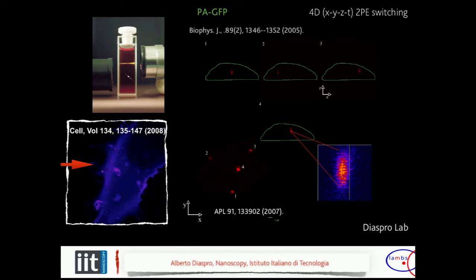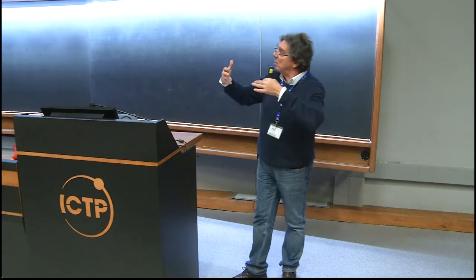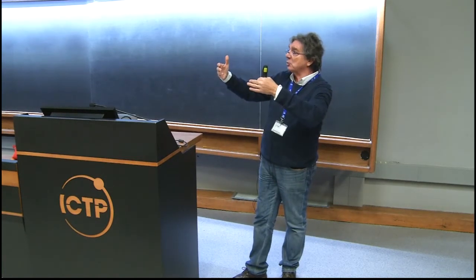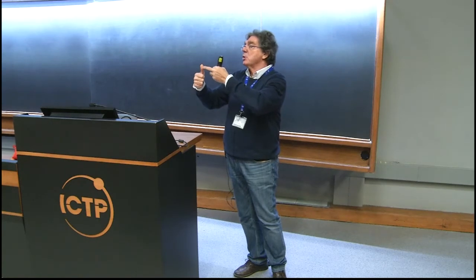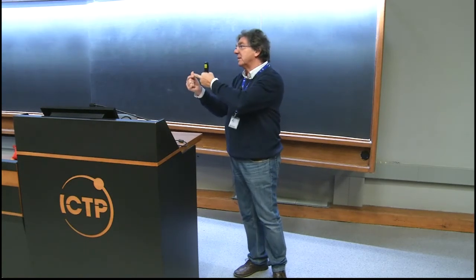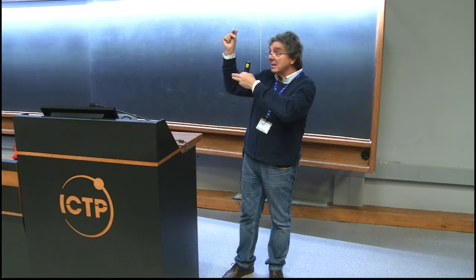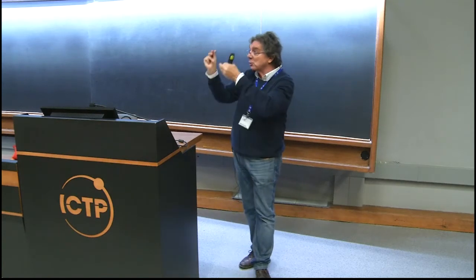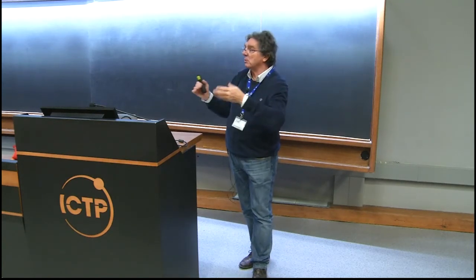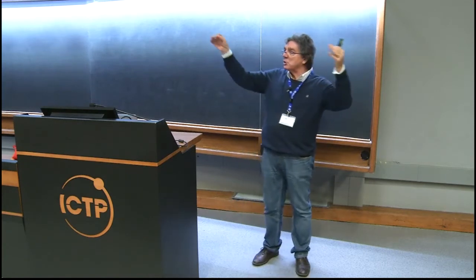So in this case, you are able to increase what is giving you fluorescence, because you have a protein that you can express wherever you want. You can adapt to this protein a signal that is the green fluorescent protein. You can switch on this when you need, and with 2-photon, you can be very sharp in the region where you switch on your molecule. And so if you have a question related to a process in the cell from one region to the other, you can use this for approaching it.